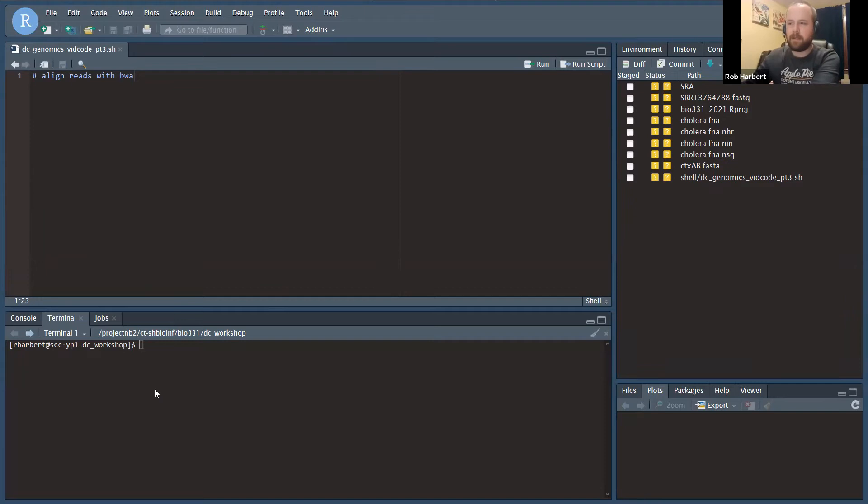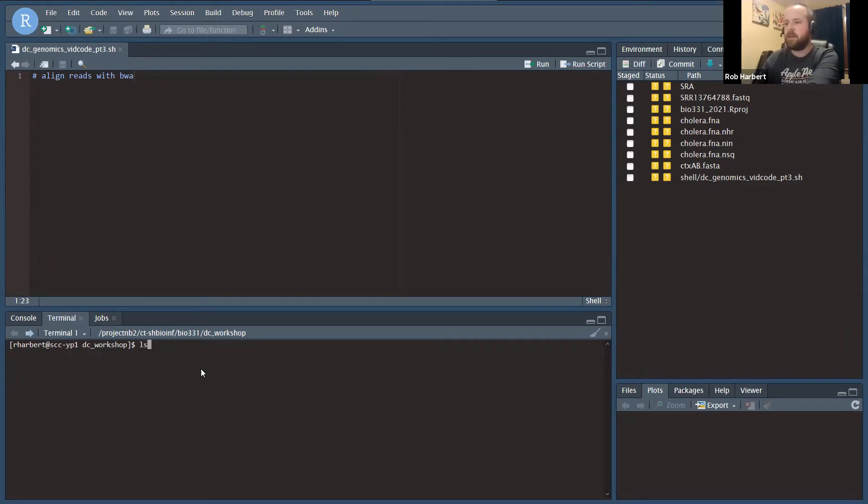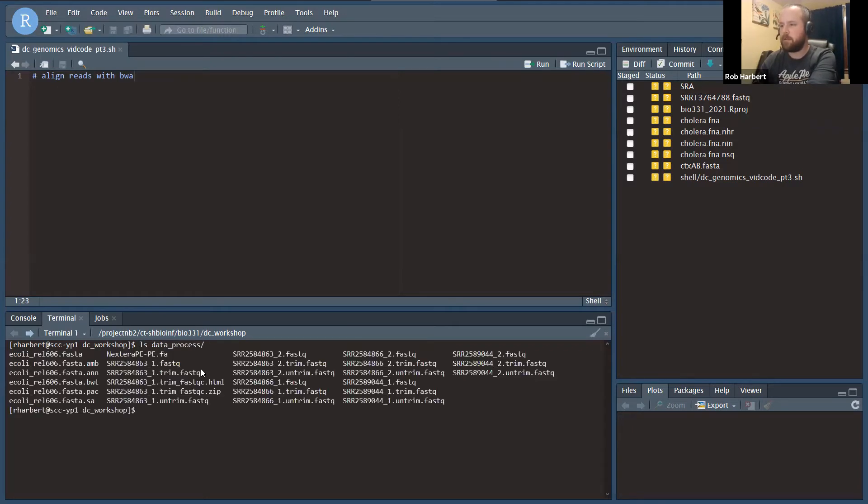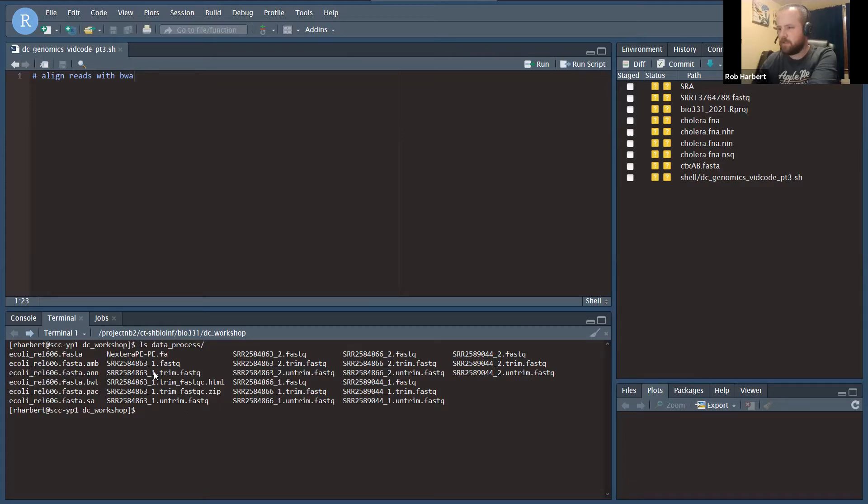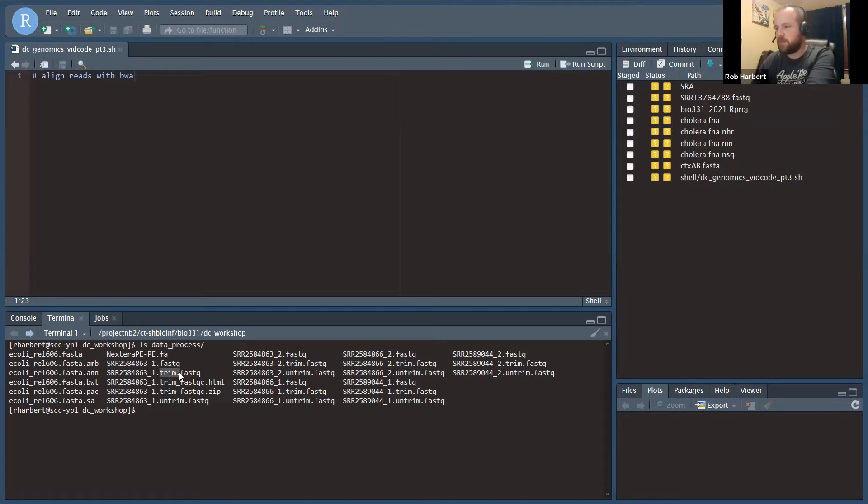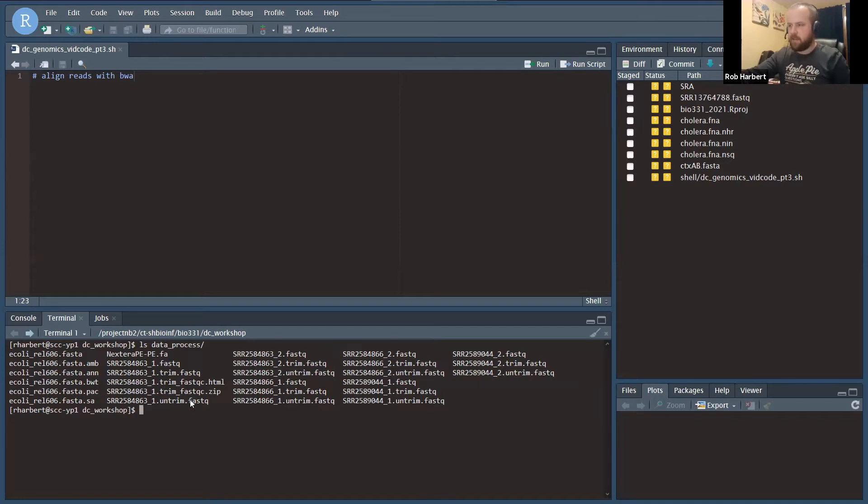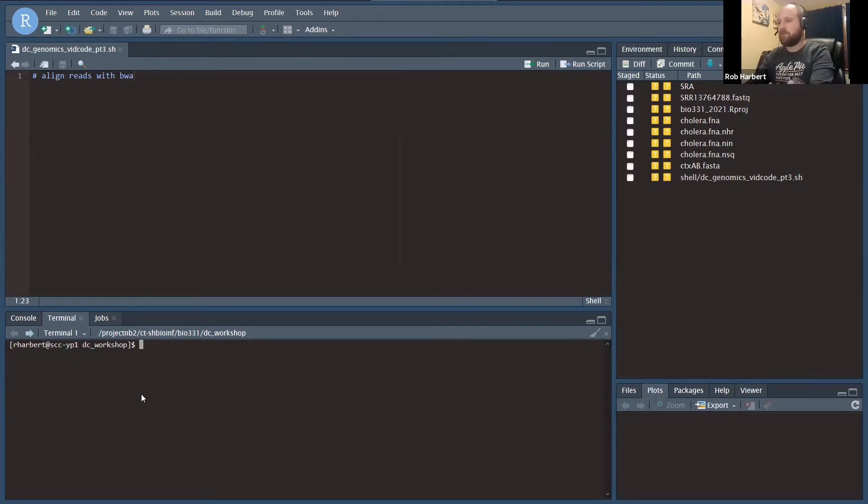Last time we ran Trim-O-Matic and trimmed our reads in a folder called data process. You might recall we have our original FASTQ files for each of our six FASTQ files, three samples, and now we have trim.FASTQ and untrim.FASTQ. We're going to work with the trim.FASTQ files today for aligning to our reference genome.